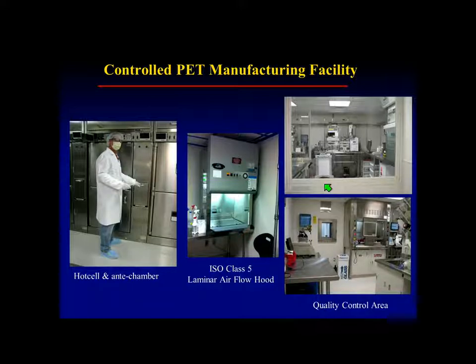So again, this is an ISO 5 area. Our room is probably running at ISO 8, which is what, if you work in traditional nuclear medicine, generators can be eluted in. It really doesn't require a lot except that you have to keep the paper out. Particles are what you're looking at, and you have to keep it clean.